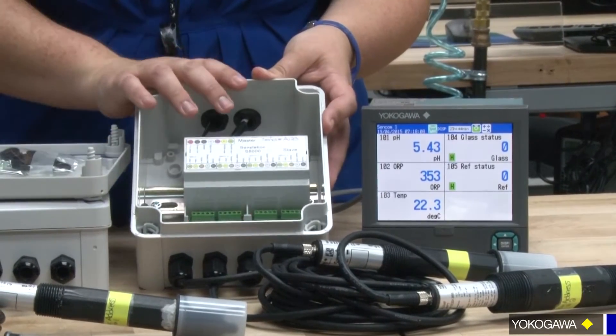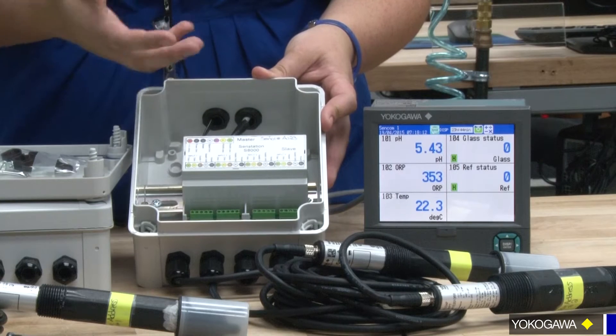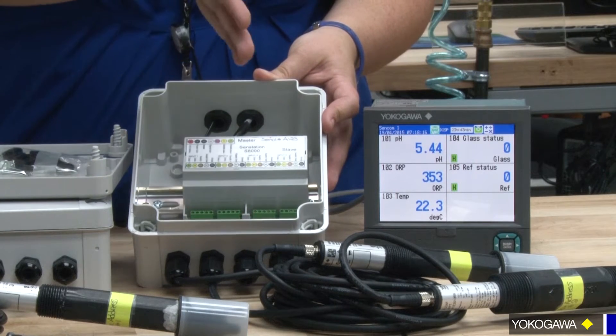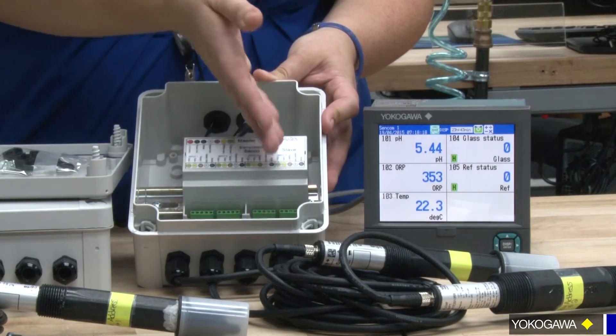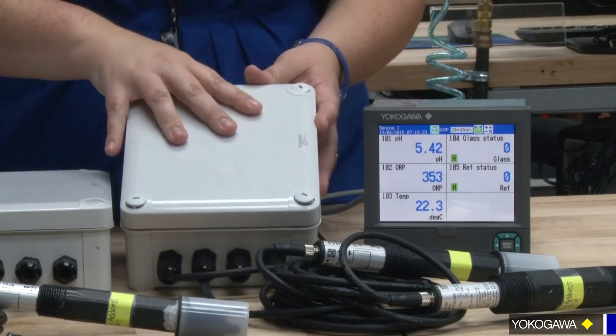There are four sensors that can connect to one isolation box. This is needed because the signal needs to be isolated — it needs to be galvanically isolated — not on the measuring signal, but also on the power signal.